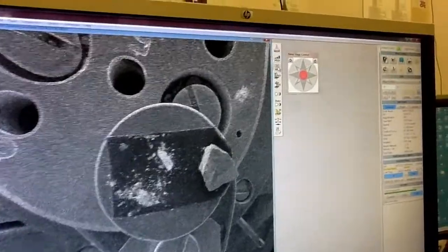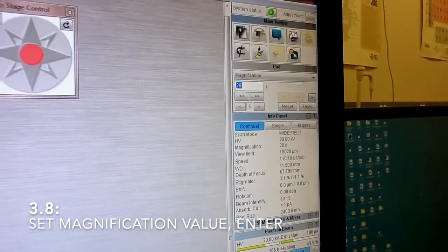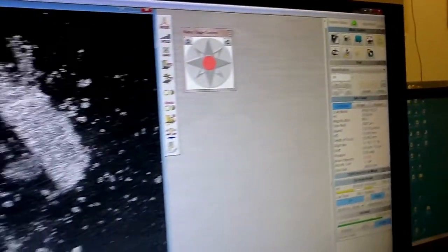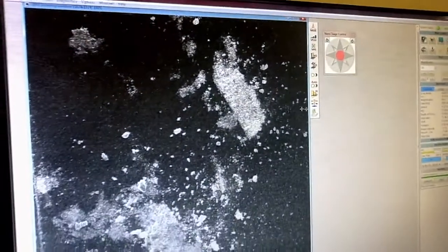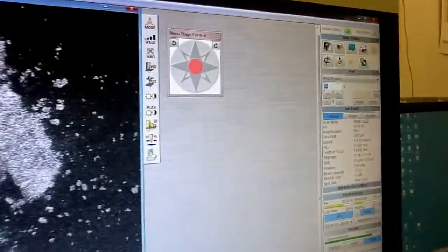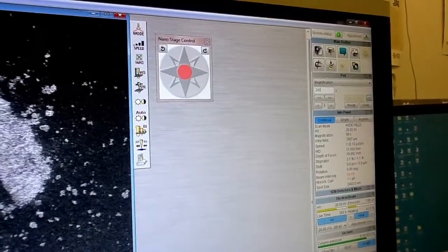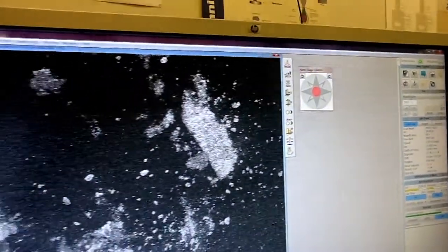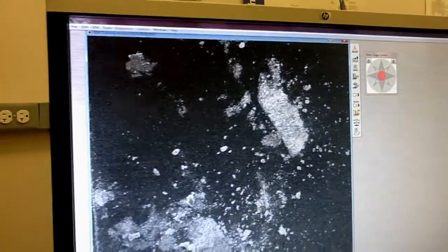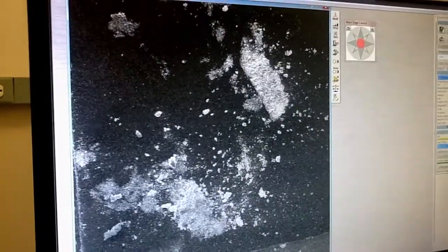Now increase the magnification — press the magnification button and maybe type 100. Now let's go to 200. This is our limit for wide field view. Now you want to go to resolution mode, because we started with wide field view just to find the sample. Resolution mode gives us a much wider range of magnification, so we can go to even higher magnification — let's say 400.